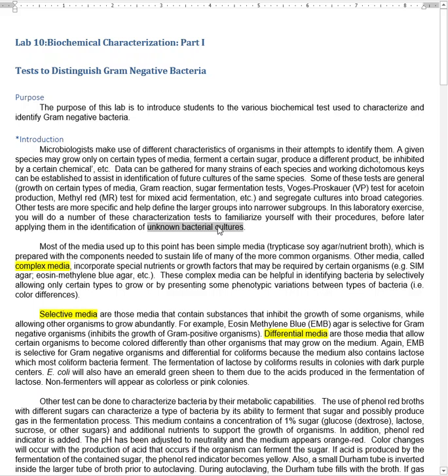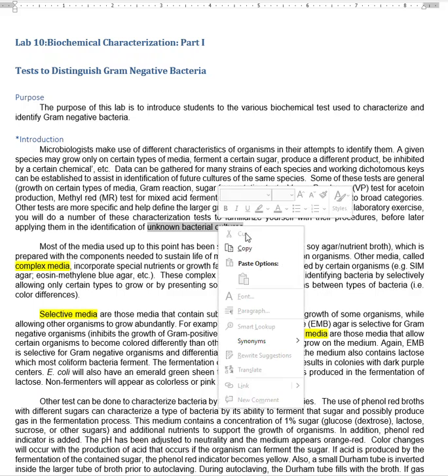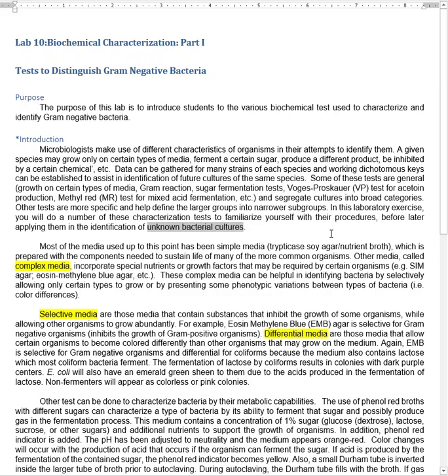So these are for the unknown bacteria cultures. Now, you guys will not be using this like we do normally in the actual lab. And I'm thinking I need to check on it because I'm about to give you guys the unknown lecture or the unknown lab information, probably by the end of this week. But this is where we're going to be with this guy. We keep narrowing it down.